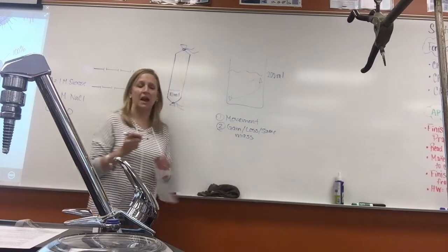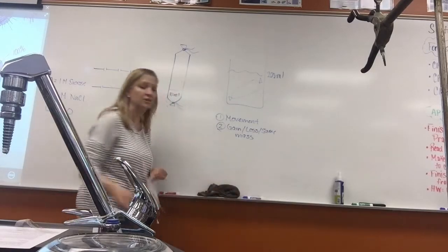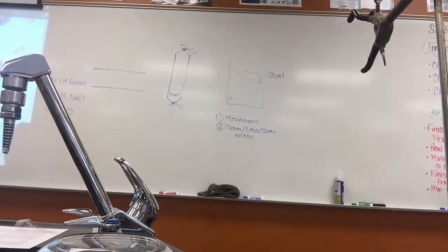All right, so you're making a hypothesis on that, and you're drawing in arrows up here. All right, and you're going to do that for all three of your setups. So you're making a hypothesis. You can talk amongst yourselves about what you think is going to happen. A hypothesis is based upon prior knowledge, so things that you know.